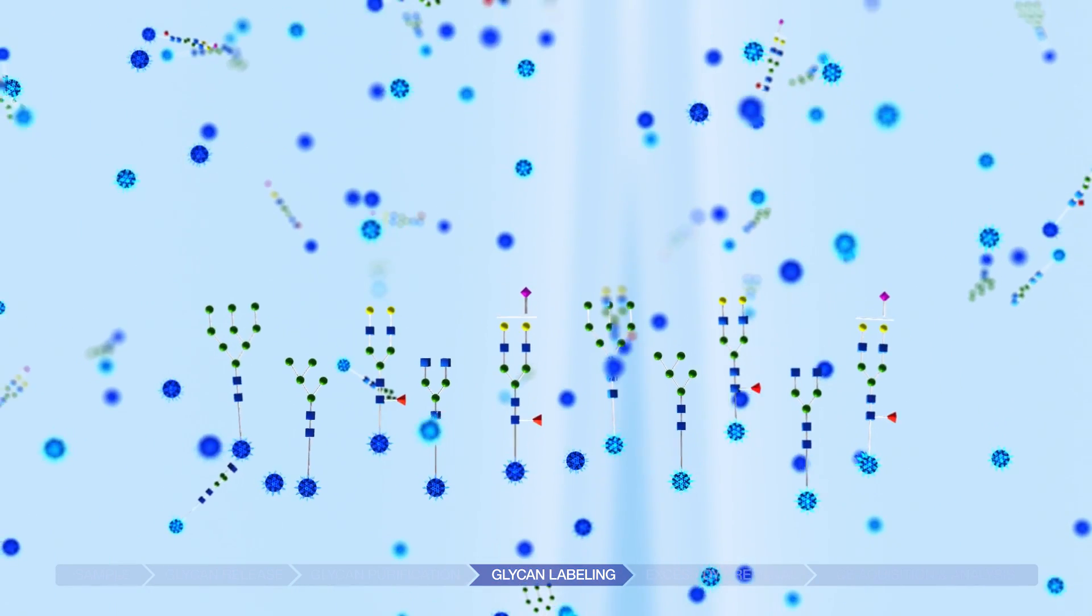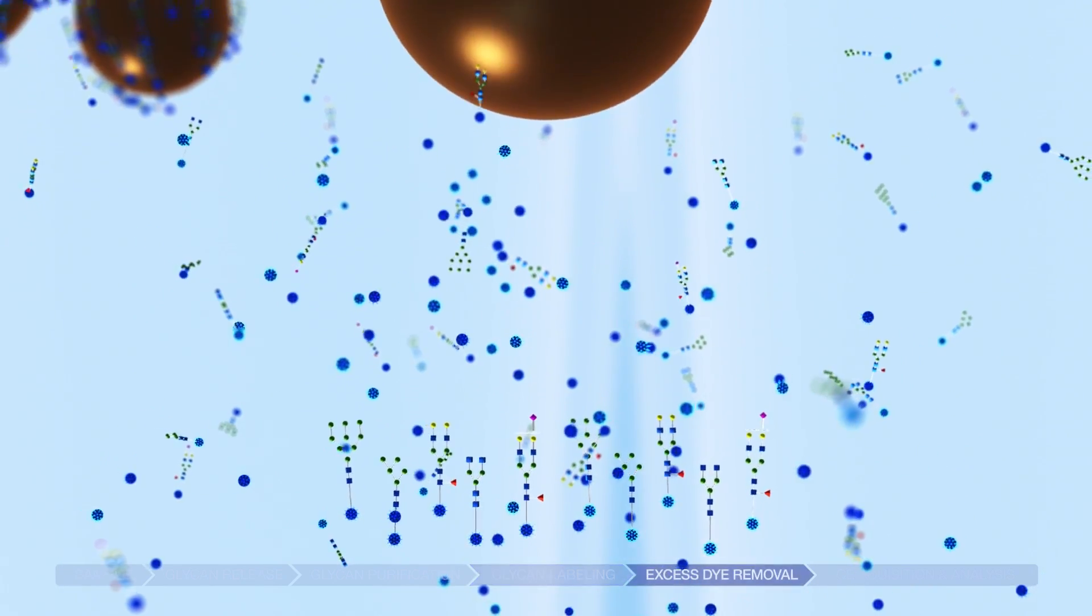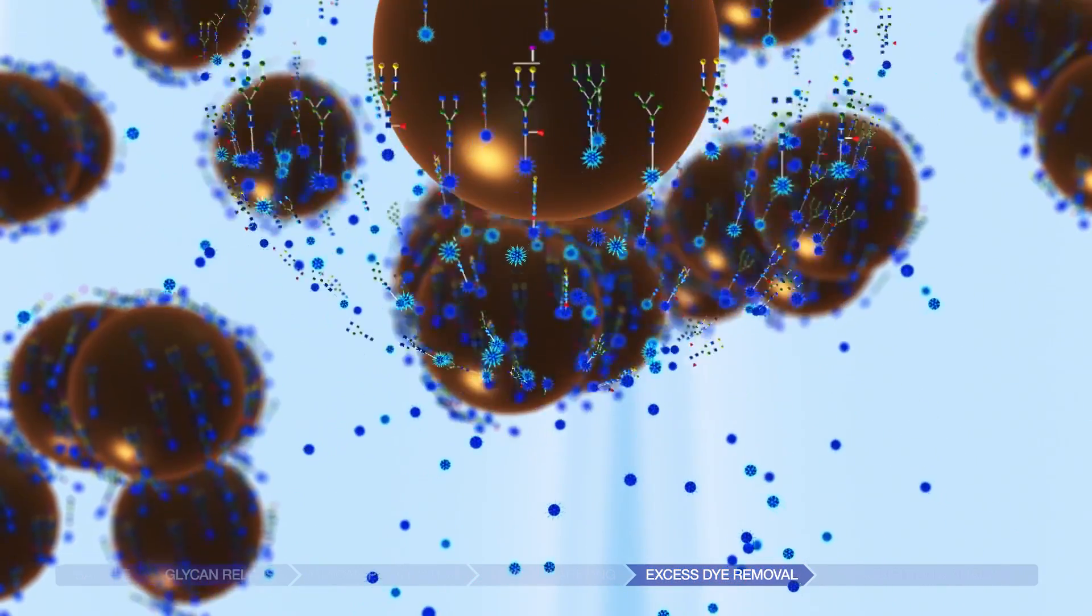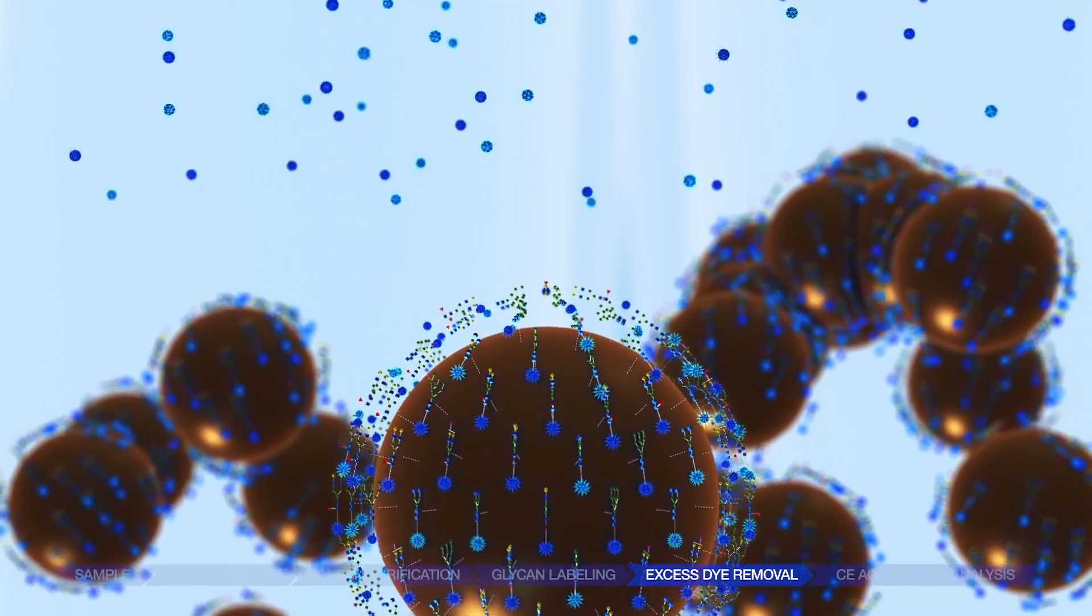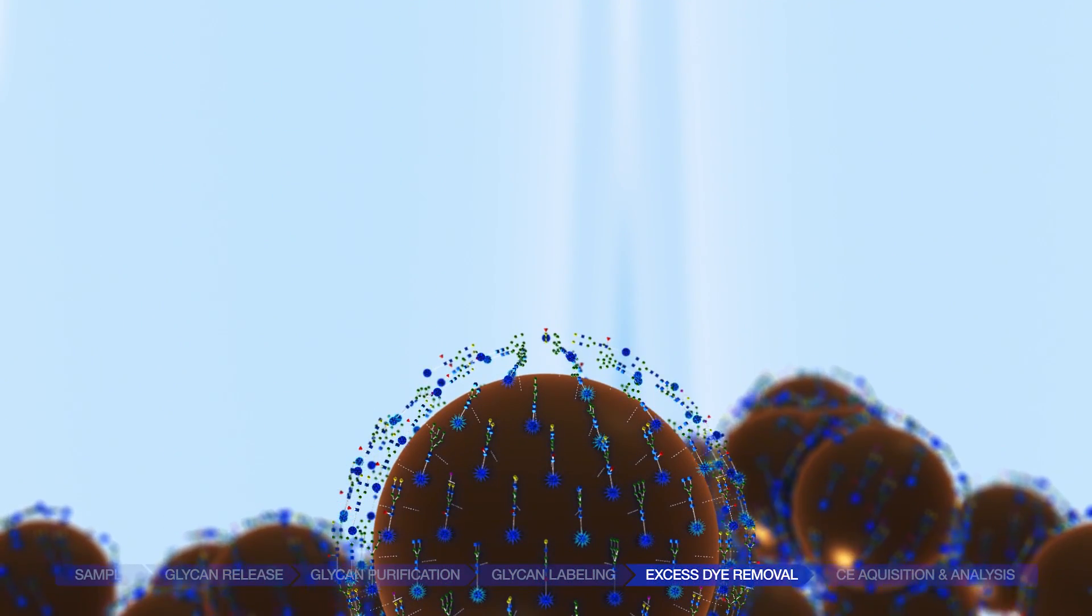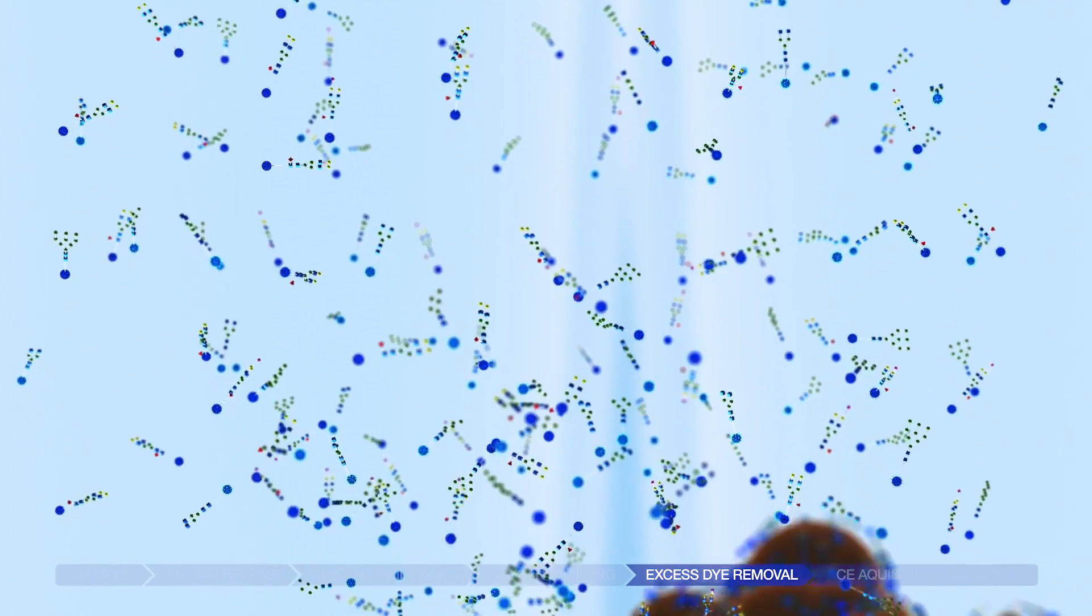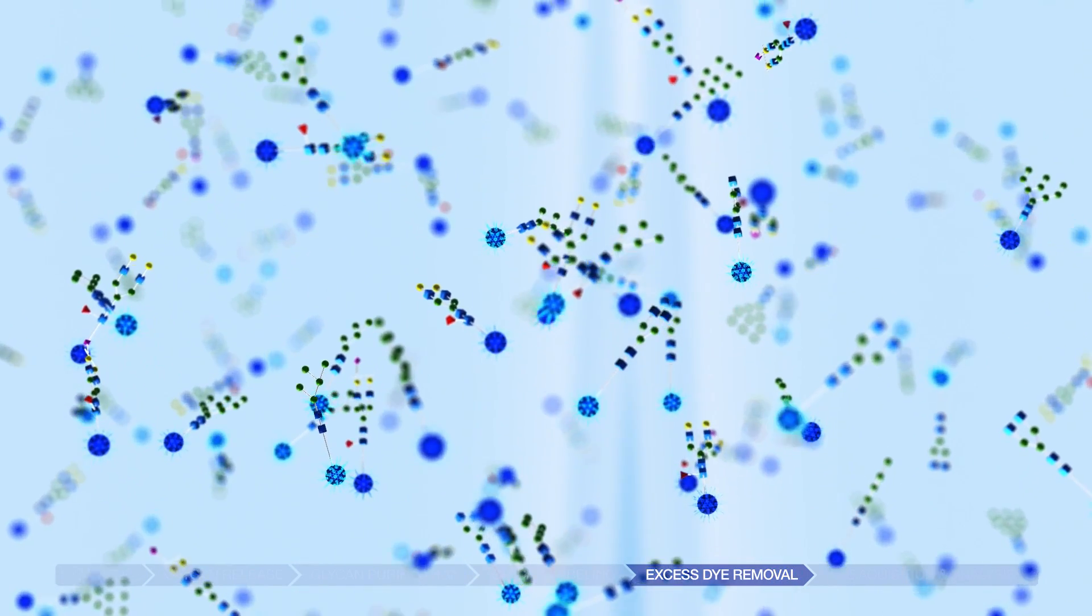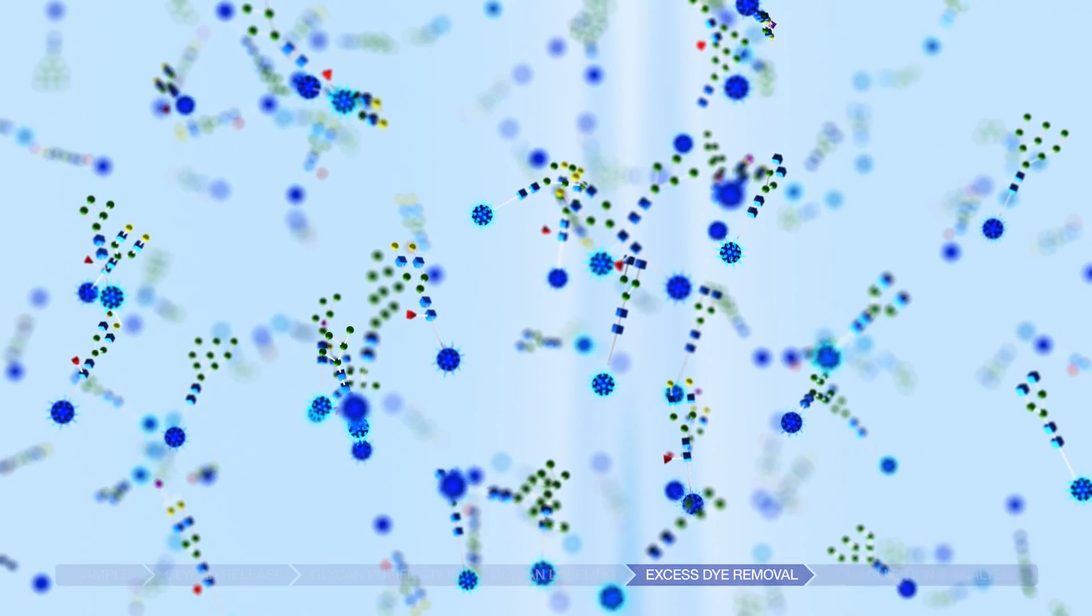For APTS and turquoise, the excess dye is removed. This step is not needed for teal. Magnetic beads are added, and the dye-labeled glycans bind to the beads. The beads are separated, leaving the dye-labeled glycans ready for CE acquisition and analysis with the 3500 or 3500XL protein quality analyzer and the Glycan Assure acquisition and analysis software packages.